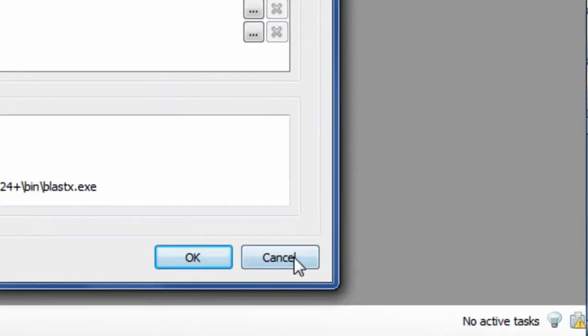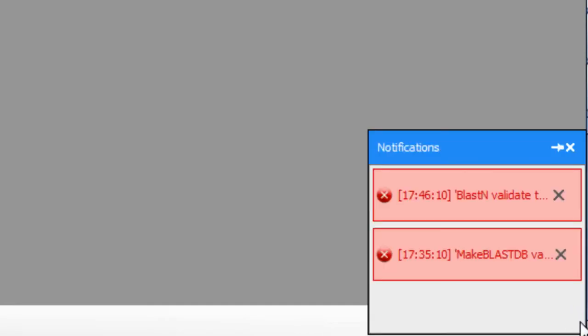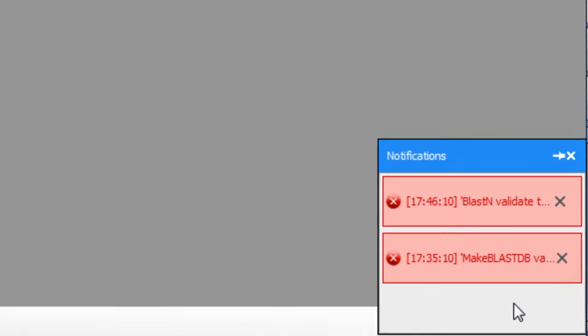In the new UGENE, when the system has a new message for you, it will be displayed as a popup. It is always possible to see the full notifications list by clicking the notifications icon at the bottom right corner of the program window.